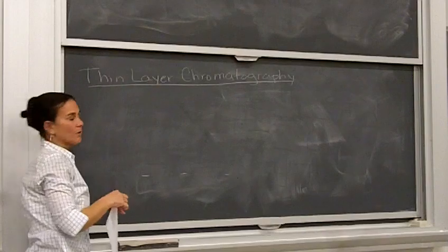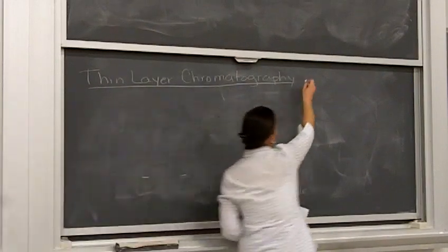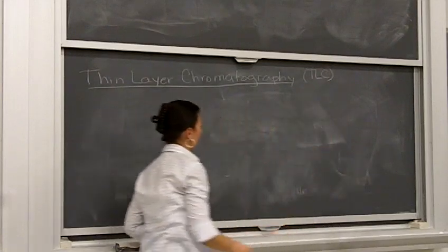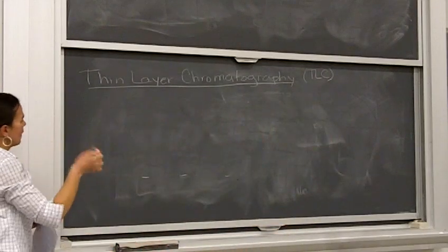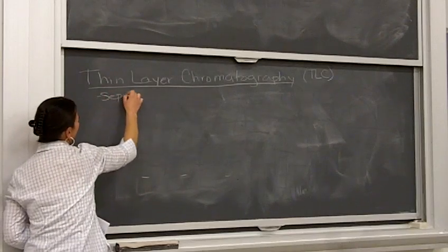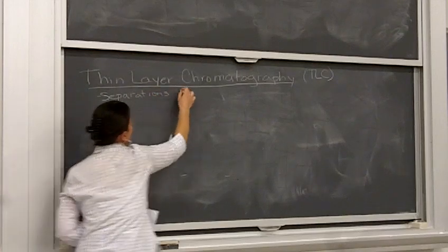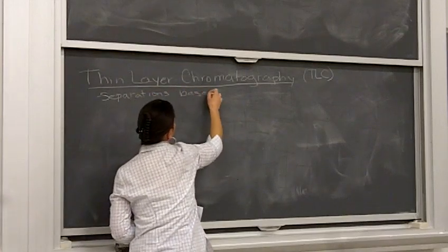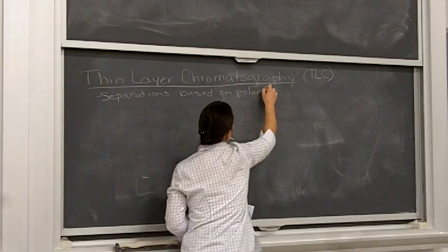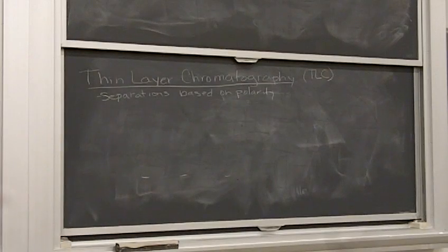Because that's what's involved with chromatography, okay? It's also known as TLC, all right? It separates things best based off of polarity. So you've got separations based on polarity.